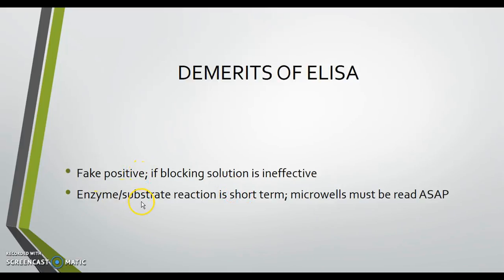When an enzyme and substrate are added together, the reaction immediately starts. Therefore, the plate should be run immediately in order to avoid a fake positive result.